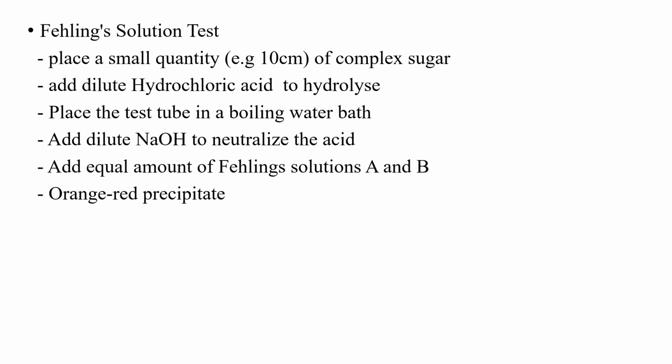This you don't boil directly. You don't place the boiling tube or the test tube directly on the fire, but you place it in a water bath.